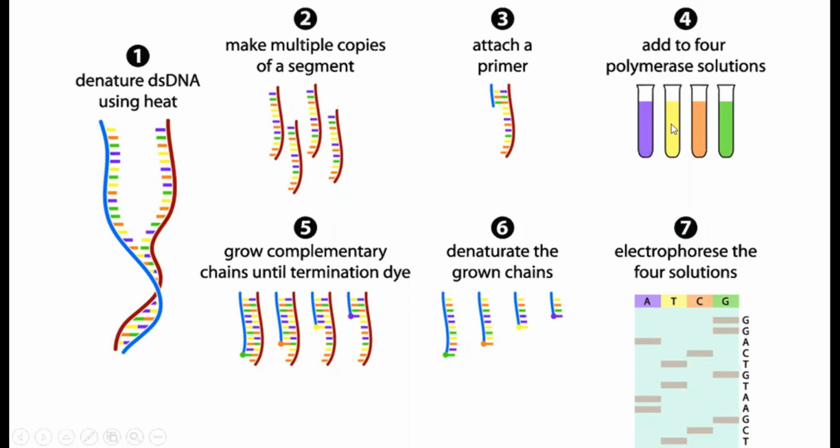So once you first add your dNTPs, the complementary strand will grow out accordingly because new nucleotides are coming in and you are adding dNTPs. So 3' OH groups are present. Now, as soon as you get a desired length, let's say, then you add ddNTPs as well. Once you add ddNTPs, as soon as your ddNTP integrates here, this chain is terminated because the 3' OH group is removed from here and no further nucleotide can bind over here.